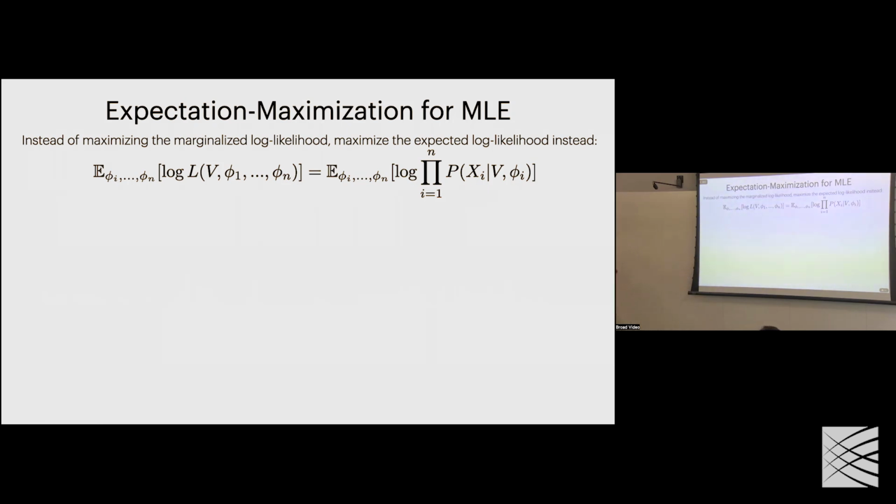If we take a look at this quantity that we want to optimize, there are two ways to maximize it. This is an expectation of this log likelihood over the space of poses. And so to maximize this, there are essentially two things we can do. One is to draw these poses from a distribution that matches the true distribution of poses. The second is choosing a volume that maximizes this expectation. And so the EM algorithm is essentially alternating between these two steps.